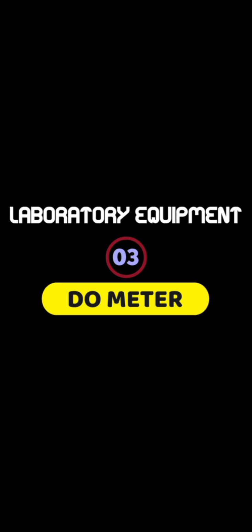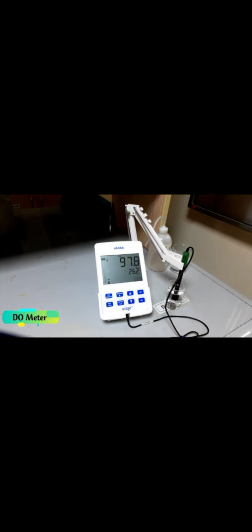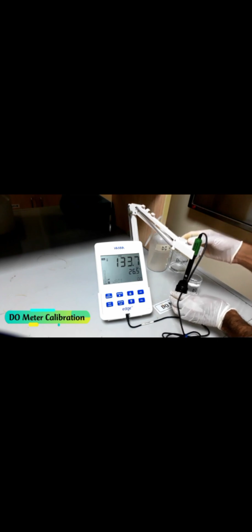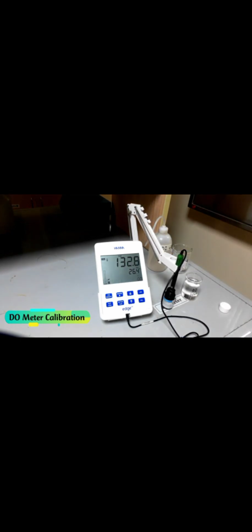Dissolved oxygen meter. Dissolved oxygen meter is mainly used in water analysis. As the name implies, it is used to know the presence, absence, or level of oxygen in a water body. For this machine to give an accurate result, it must be calibrated using a sample of known DO or distilled water.